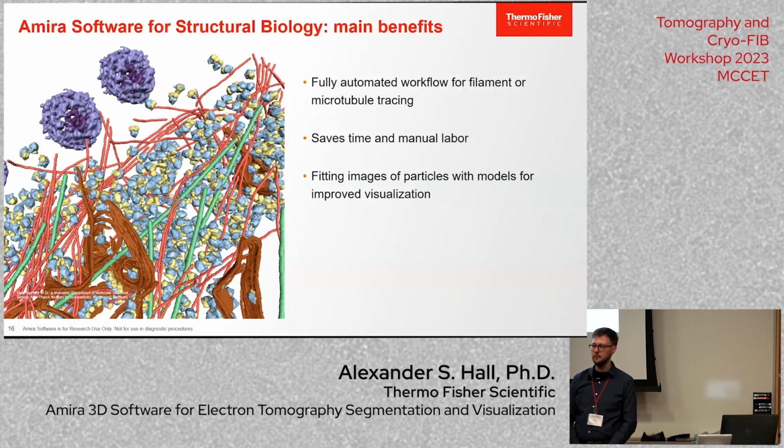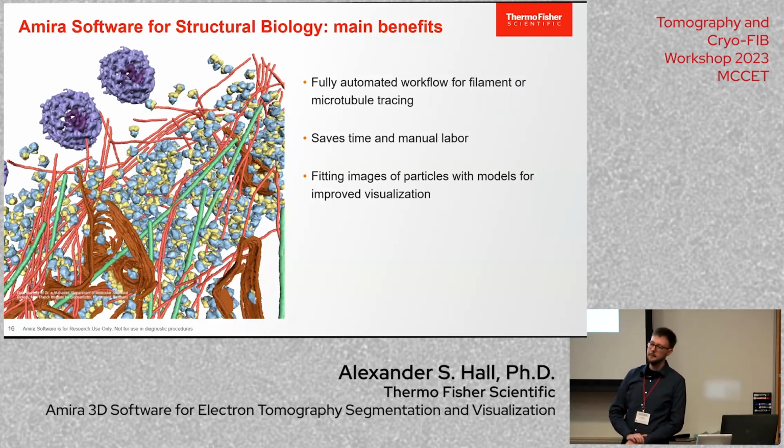Okay. Yes. Hey, so maybe this is the meshing tool you briefly mentioned, but is there an easy tool for converting, say, a membrane or some of your segmentation data to an oversampled array of points that you could import as seeding subtomogram coordinates? Sure. Yeah. Amira has a lot, and I really do mean a lot, of features.